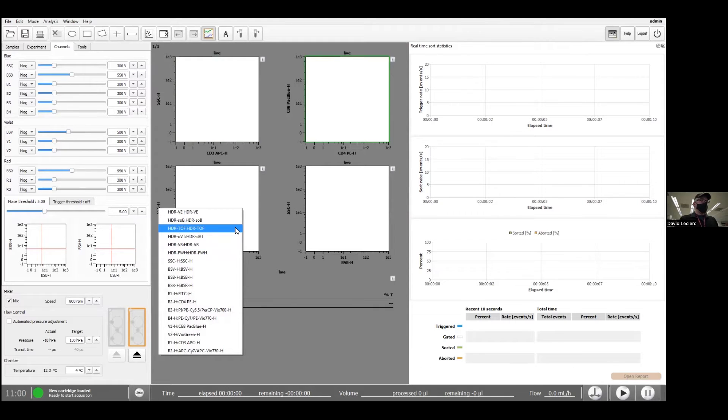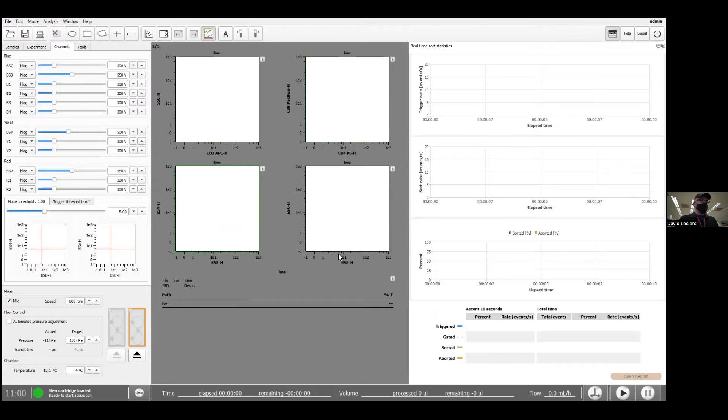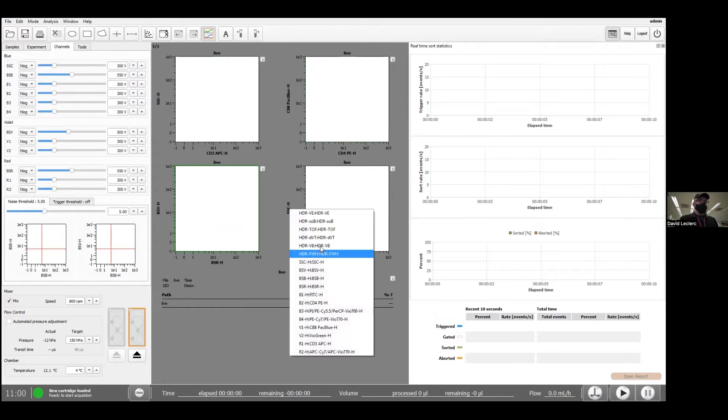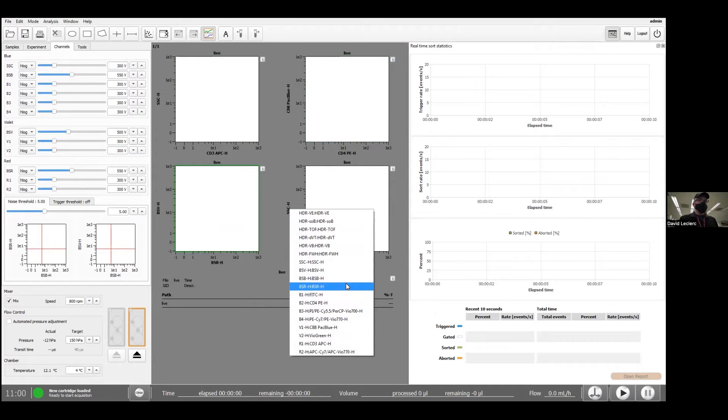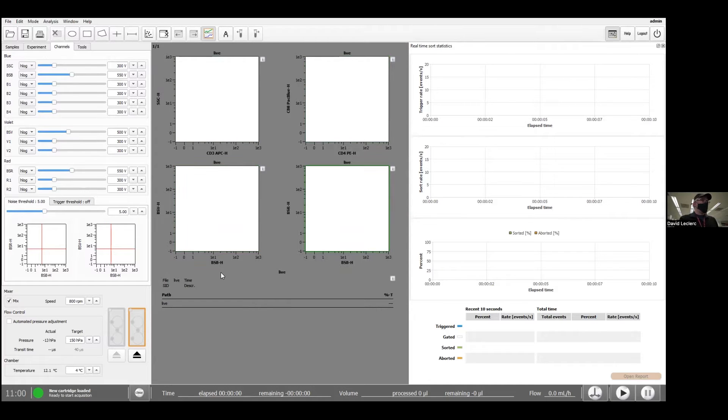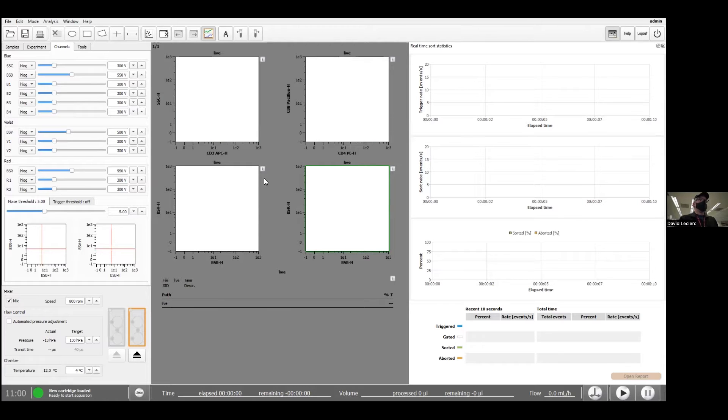I'm not going to worry too much about forward and side scatter here. Then I'll have the backscatter data for all three lasers. So that is the blue, violet and red laser. And that will basically allow me to calculate the speed of the cells as they go through the cartridge.